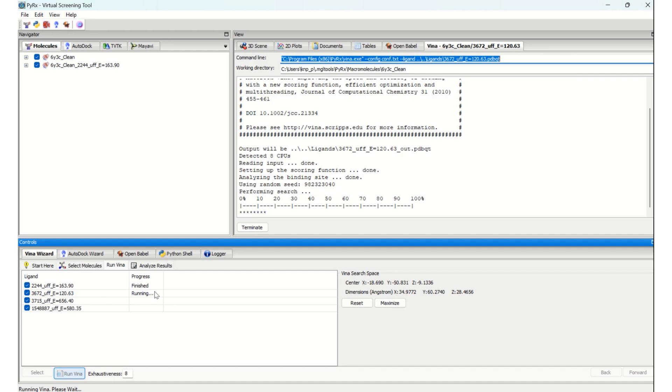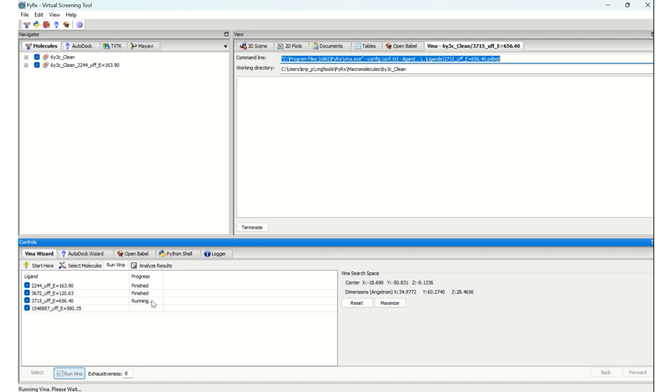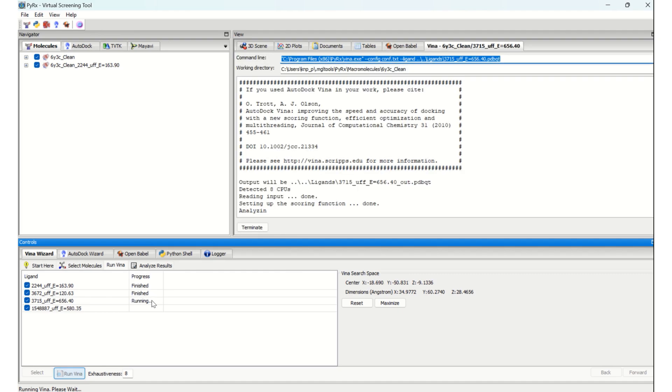It's running. By seeing the star marks, you can guess how much percentage of the work has been completed. Once this reaches 100%, you can see the dialog 'finished', and the next one, the third ligand, will start running.